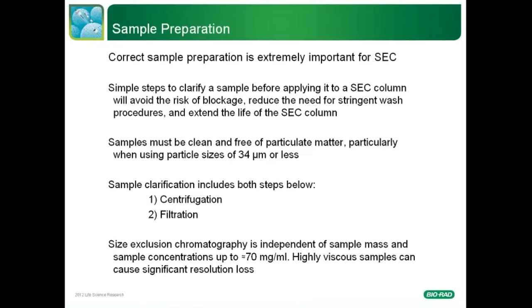Size exclusion chromatography is independent of sample mass, and sample concentrations up to approximately 70 milligrams per mL are possible. Sometimes you hear people say no more than 50 to be on the safe side. Highly viscous samples can cause significant reduction of resolution.